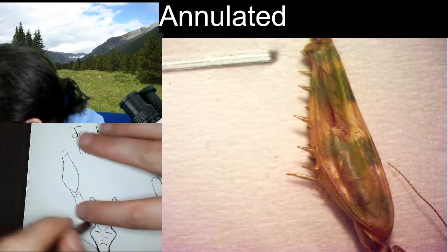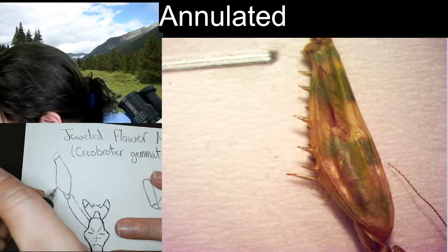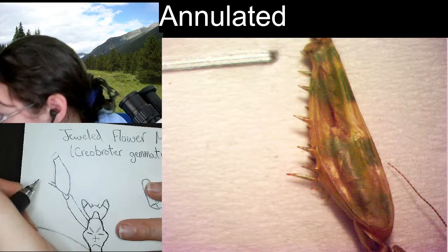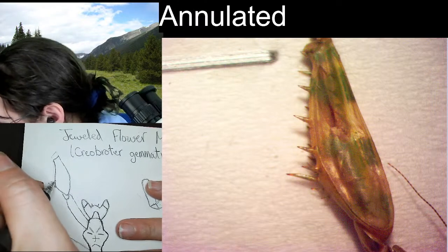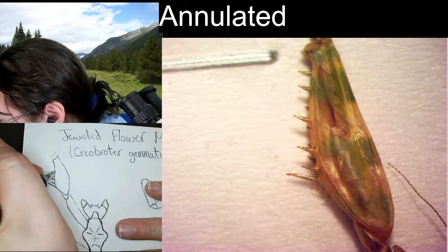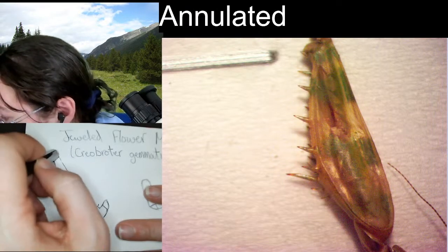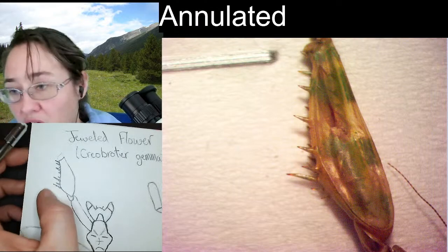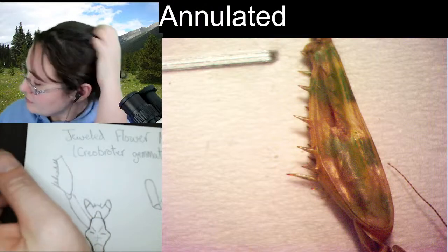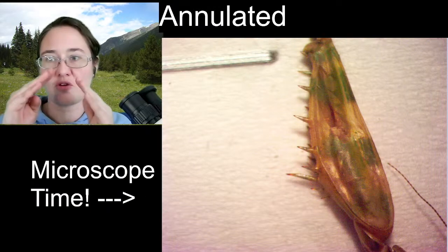All right, now you've got some spines here. Let's see. The biggest one at the base coming up. And praying mantids do tend to have kind of alternating really large and then small spines. And I'm not sure if there is a reason or a purpose for this, but it is something that I have seen regularly now on mantids, where the spines are not all the same. They're not all long. They alternate long to short. I'm going to have to look closer at the mantids when they're alive and see if the long ones on one side equate to a short one on the other side.